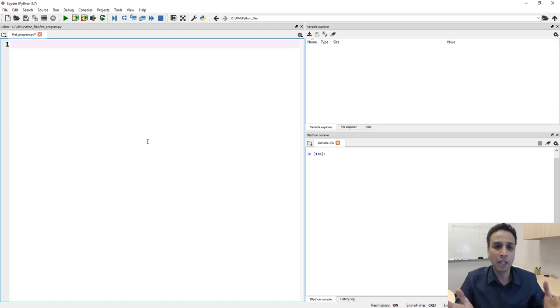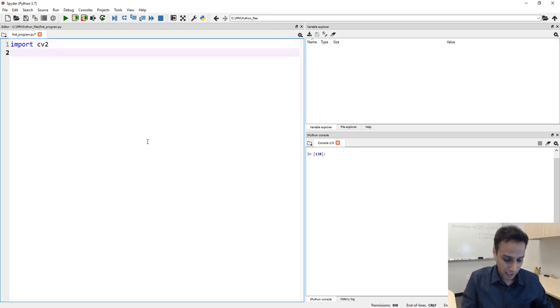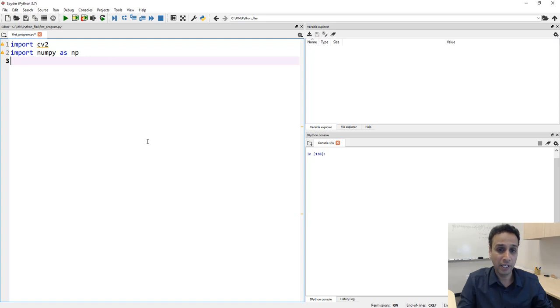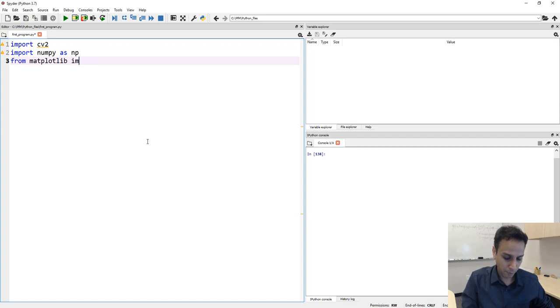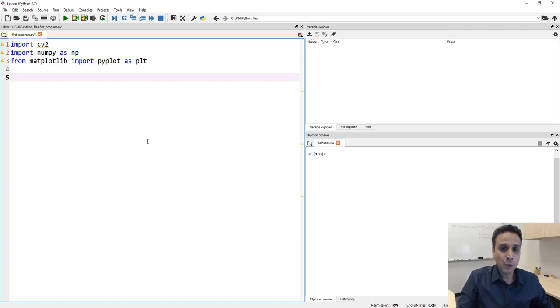Let's go ahead and import the right libraries. I'm going to do import cv2 for OpenCV, import numpy as np because I always tend to use at least one functionality available in NumPy to manipulate my array, and from matplotlib import pyplot as plt for plotting histograms or images.